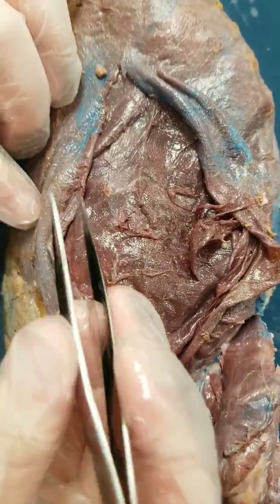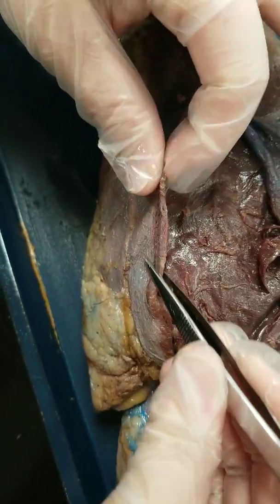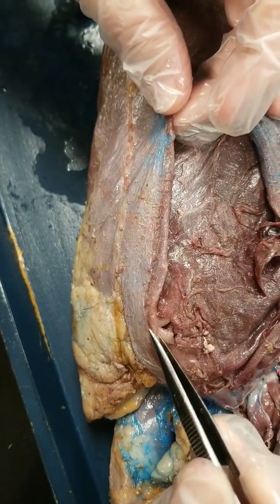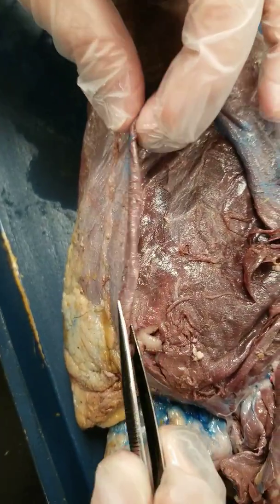The next muscle is the rectus abdominis muscle. This is a band that goes down the center of the mink. You're going to go underneath it with your forceps and lift it up — it's a band.